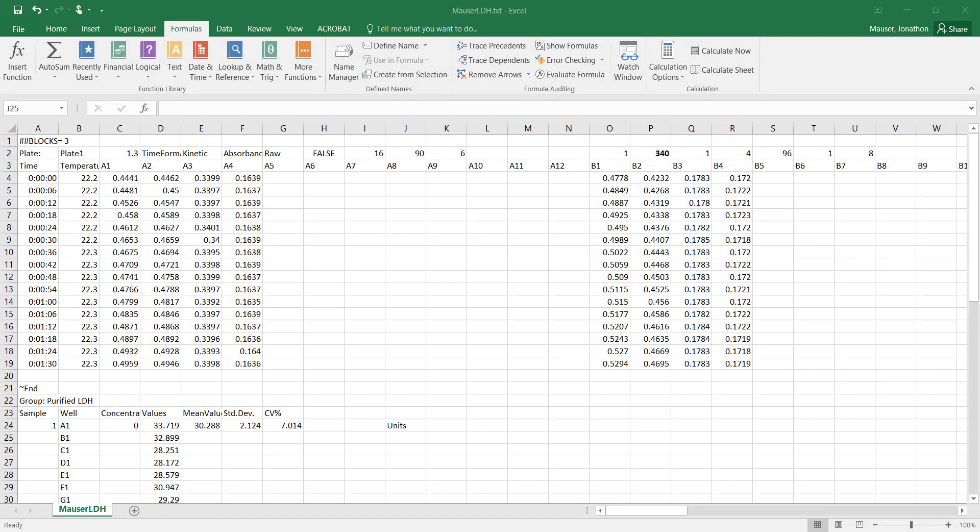Hi folks, so today we're going to talk a little bit about how to process your data from the plate reader for an LDH activity assay.